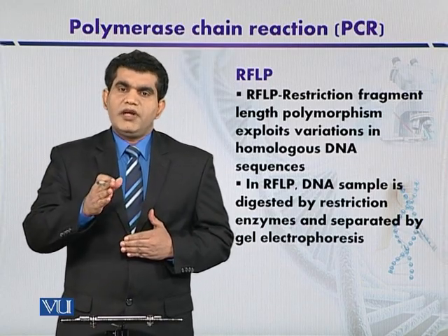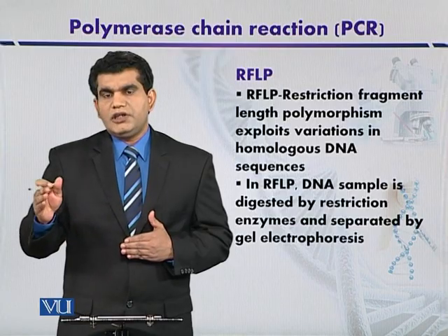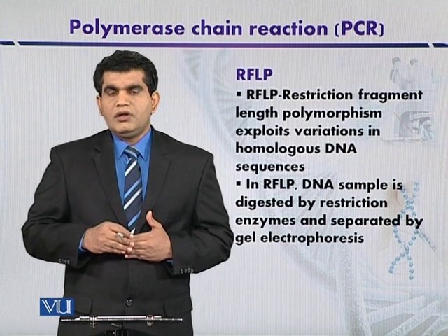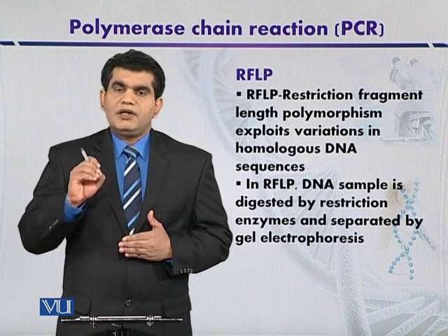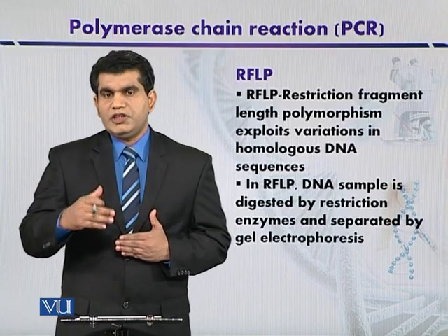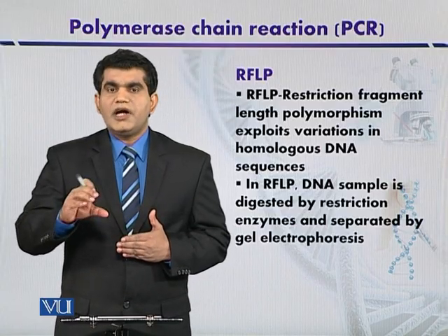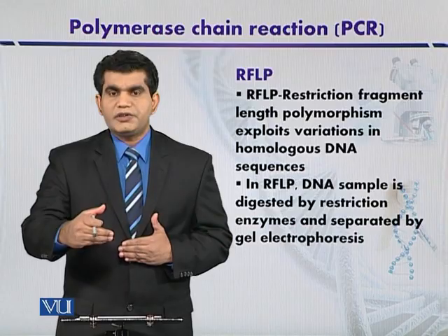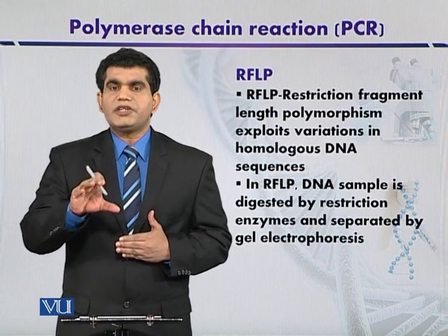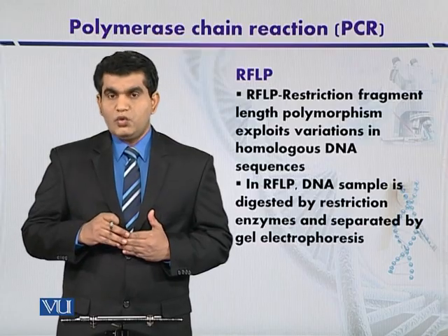So when one nucleotide changes among 1000 nucleotides from individual to individual, then the target sites for different restriction enzymes can also be changed. So these slight changes, like 0.1%, can influence the restriction pattern of the genomic DNA.